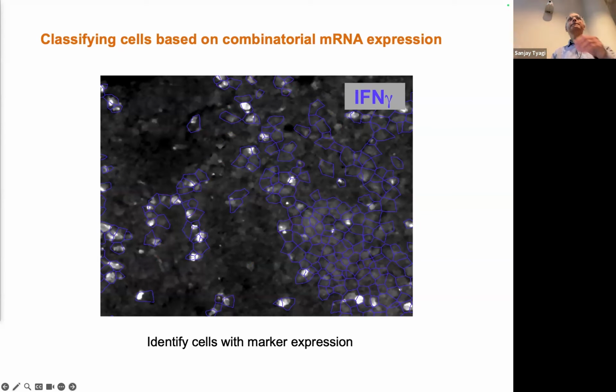Yeah. This field has a certain depth, right? Yeah, we treat this as flat. These are about 5 micrometer thick sections. And so occasionally there will be nuclei on top of each other, and to the extent they create errors, the errors are apparent in this image.